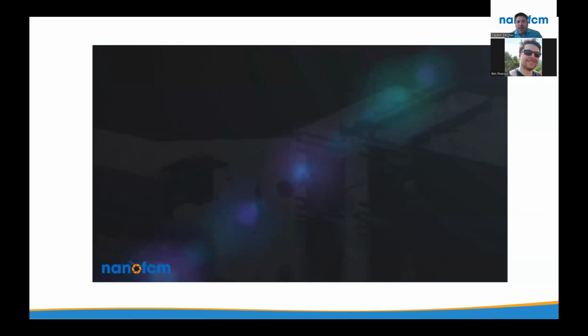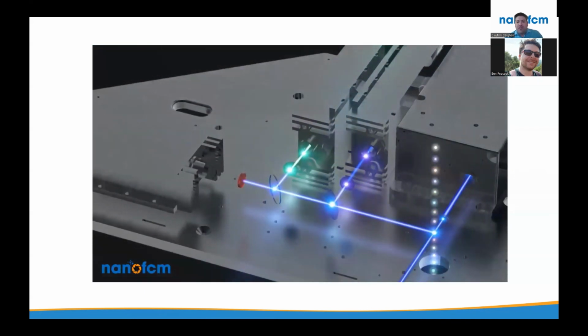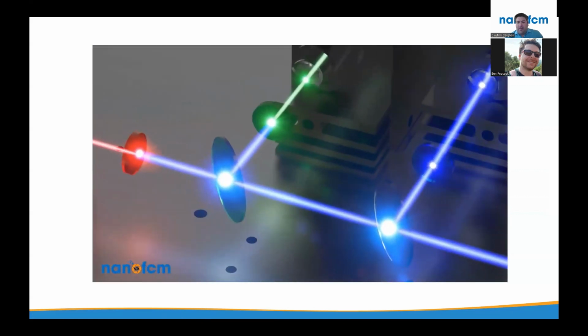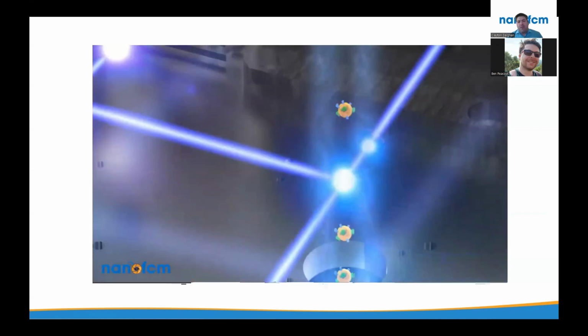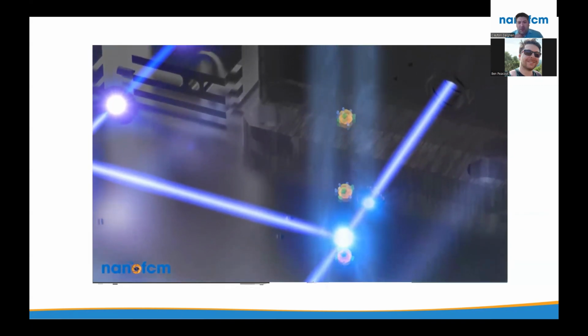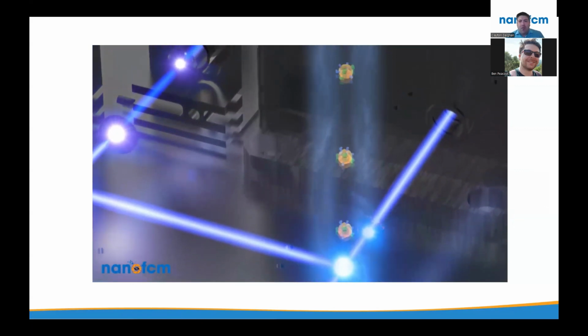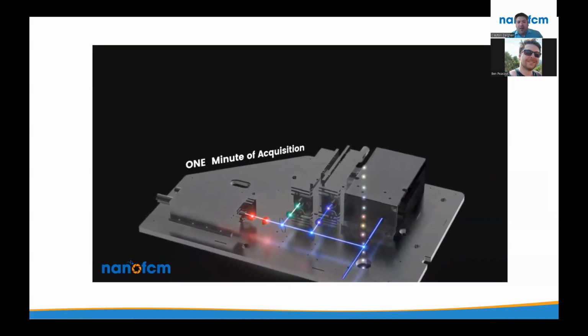And the capillary at the other end terminates in a flow cell. And as the particles are released into the flow cell, they are passing through the lasers, and all the lasers and detectors are collinear. So there's no time component. There's no separation in space of when the particle interacts with different lasers or detectors. It all goes on down one line, which is very valuable for interpreting the nanoscale data here.